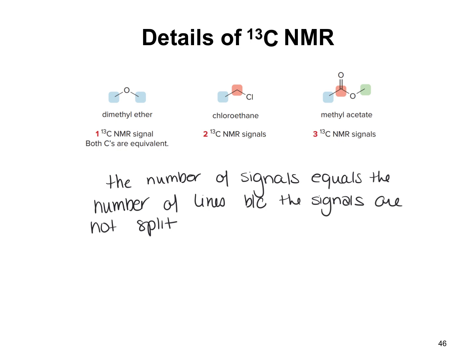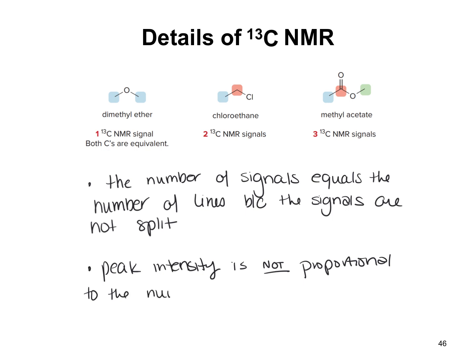Unfortunately, though, peak intensity is not proportional to the number of absorbing carbons. And so what that means is carbon-13 is not integrated.